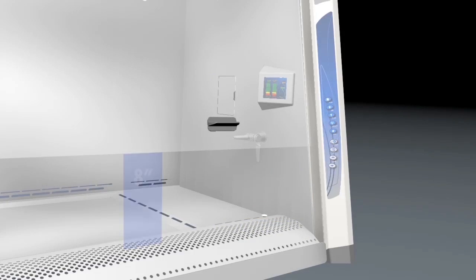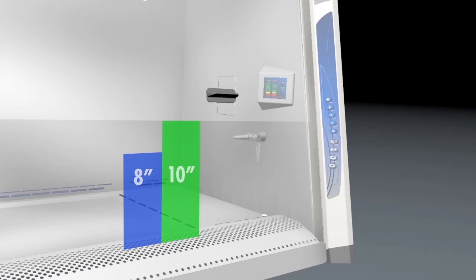The Axiom also allows the lab to select from two operational sash heights. This setting can be changed when needed through the MyLogic operating system. No physical alterations are required.